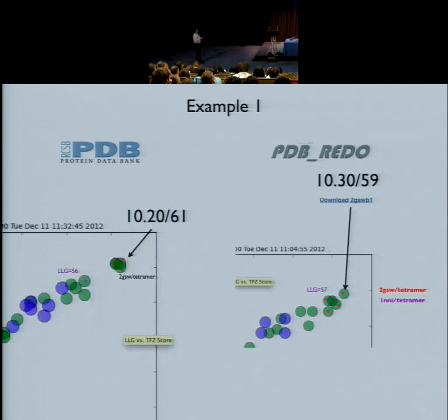Some interesting things when you look at the top peaks. Actually, the top peaks in the PDB subset came from the same structure. So you can see probably what happened in the PDB redo refinement: the NCS restraints were released. So now we have a slightly bigger spread between those four top domains. They still score with similar values of LLG and TFZ, but they don't overlap as much.